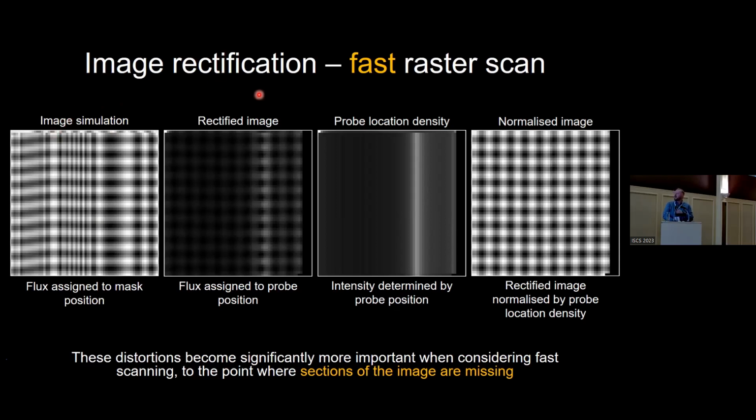It's because that's where the probe spent nearly all the time. So this is a distortion you're getting because the probe isn't anywhere near where you're thinking. And you might see this and think, oh, it doesn't look bad, but you're nowhere near where you think. This is like a false reading that you're getting. But again, if you can find a way to measure this information, you can normalize your images, and in theory, you can get something cohesive out of it.